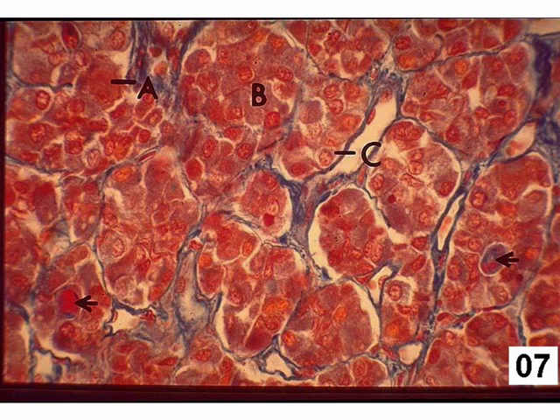You can see differences based upon histological staining. We see here this reddish staining cell, which is called an acidophil, which is red or pink in color. And then we also have a cell that stains blue. These are called basophils because they attract a bluish stain in this preparation.